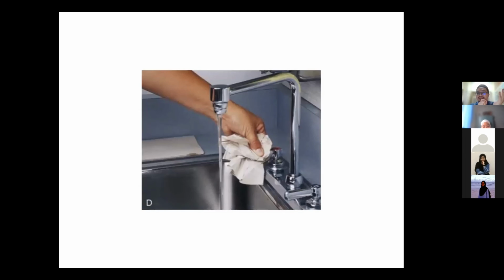And then using the same tissue, then you turn off the tap. Jangan pegang dengan tangan yang sudah bersih. And then you touch the tap, your hand becomes unclean again. Perasan tak ni? Okay, so especially kalau kat kafe kan, kadang-kadang tak ada tisu kat situ tu. So apa saya buat, selalunya saya akan basuh sikit kepala pipe tu. Sebelum saya basuh tangan saya dengan sabun, saya basuh dah siap-siap. Bila saya dah selesai basuh tangan saya, tak ada tisu, tak apalah, saya boleh touch the tap.